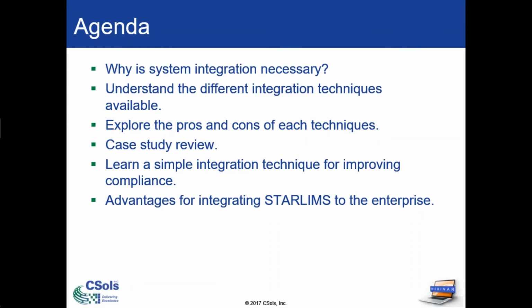We're going to go over the pros and cons of those, review a case study, an example client who we work with, and actually go through a simple technique to improve compliance. We're going to show you an example of integration technique, and just generally the advantages of integrating STARLIMS to the enterprise. So that's our agenda today.